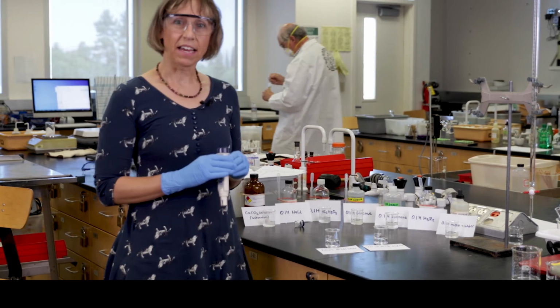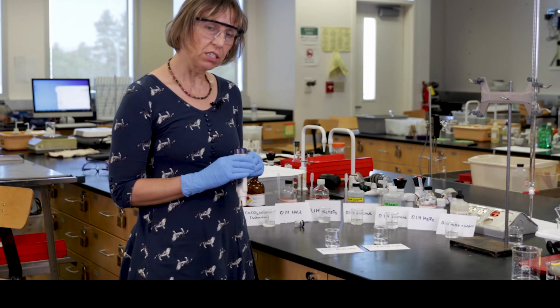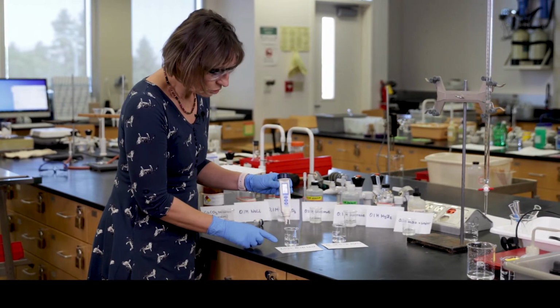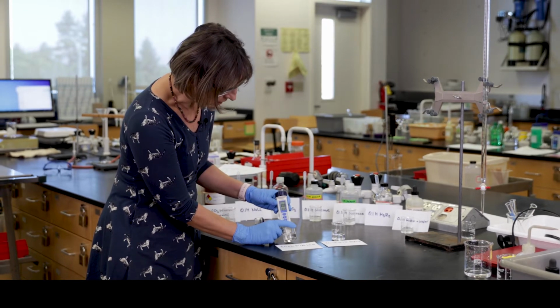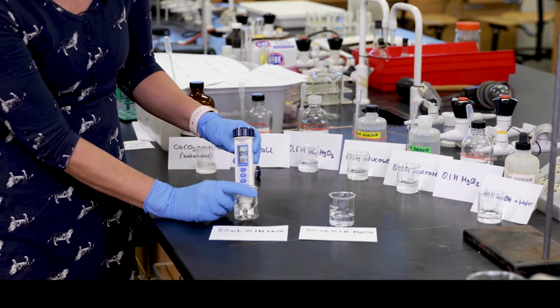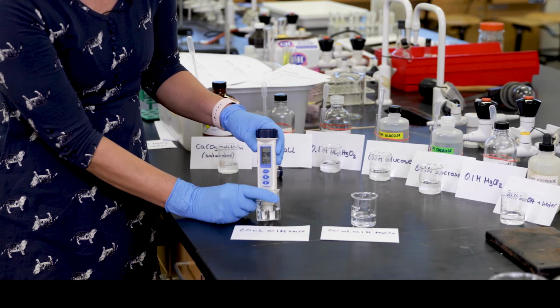Hello, so in the second part, we're going to measure the conductivity of sodium chloride solution, 20 milliliters of a 0.1 molar sodium chloride solution. The measurement is 10.45 millisiemens.